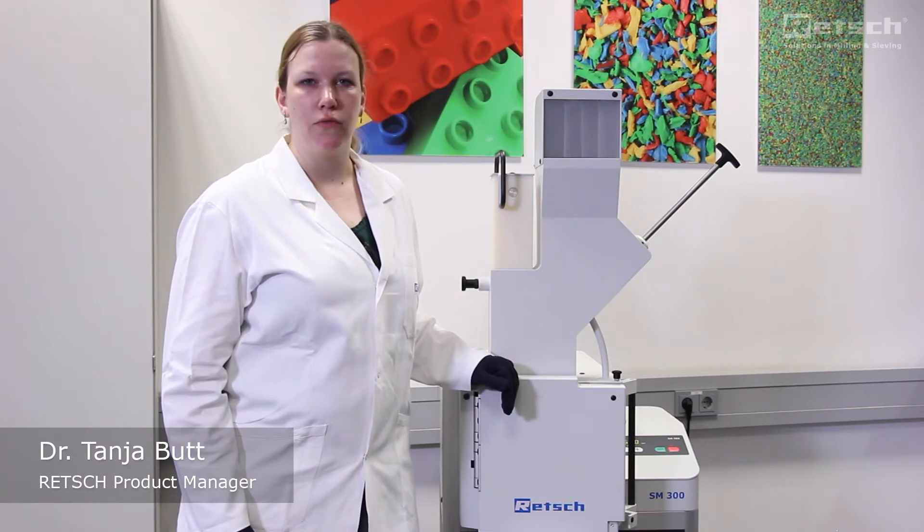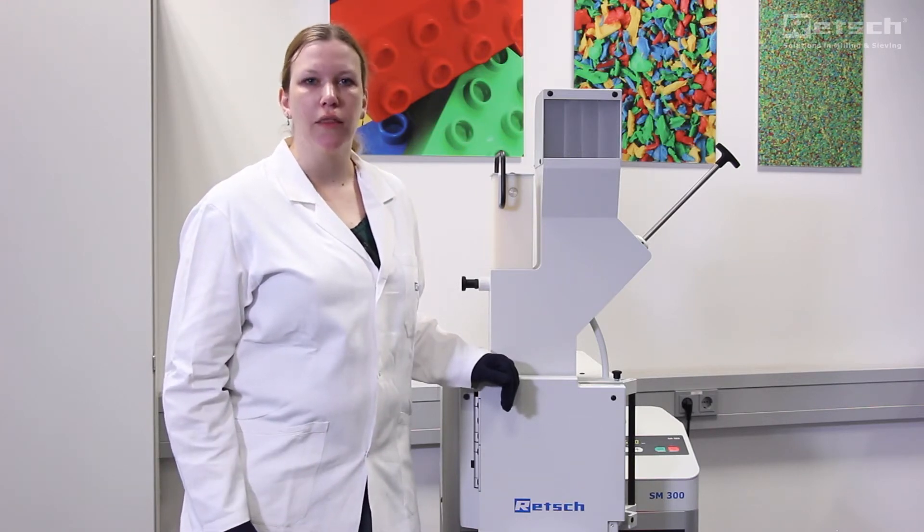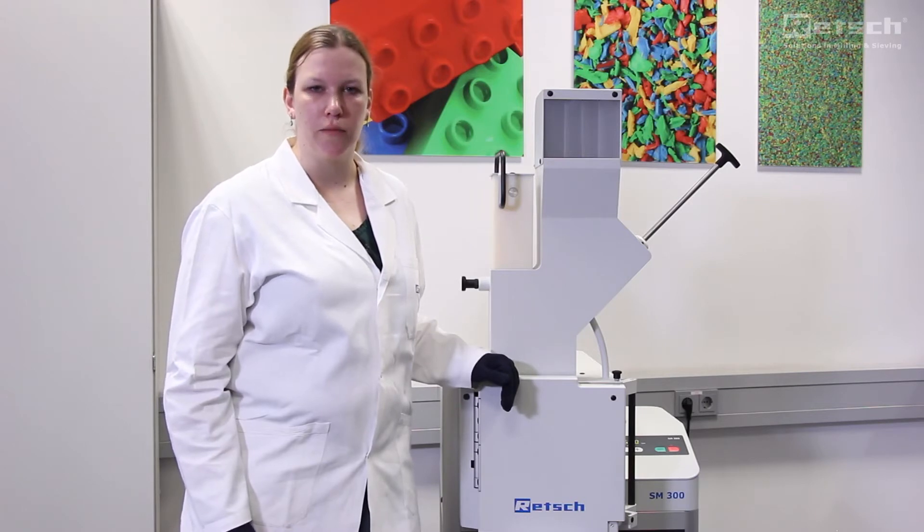Welcome everybody! My name is Dr. Tanja Butt and I'm working as a product manager for Retsch. In this video we will show you the easy handling and the user-friendly cleaning of our cutting mills.